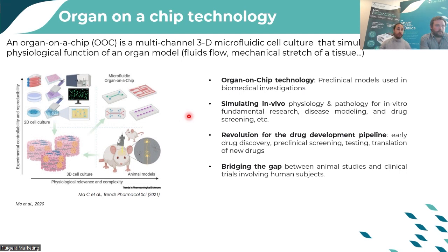I don't know if you are aware, but the Food and Drug Administration, which is responsible for the regulations around new drugs on the market, allowed last year the use of technologies other than 3D cell culture or animal models to test drugs for clinical trials. This is the new improvement in terms of this technology, and this is where we are going.